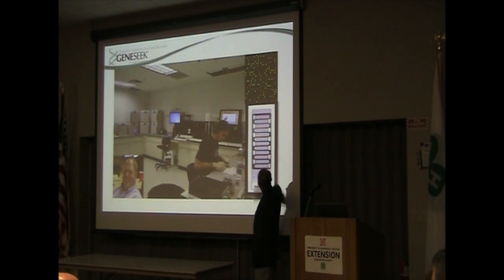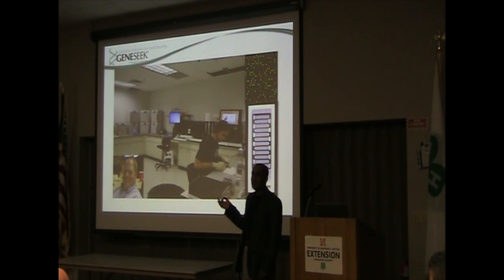Each of the strips is a band of small beads with DNA on it. So you can imagine how small that is. I think this is 12 of them, 12 different animals being analyzed on a glass slide. So a blow-up version of that is shown there. Those little dots are all little beads with little bits of DNA on them. Each of those strips is querying 80,000 data points on an animal. Okay? Actually, in reality, it's in a redundancy of 20.